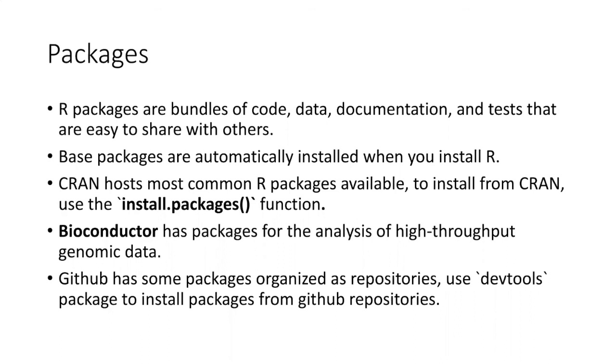And CRAN, as you know, hosts most common R packages available. And to install packages from CRAN, you can use this install.packages function. So basically in the console, you just type install.packages. Within the parentheses, you put in the package name, if you already know it. So basically, the majority of packages will be available in CRAN, and you should install packages in this way.